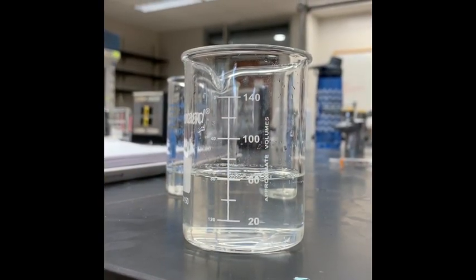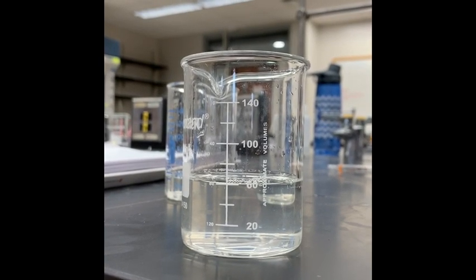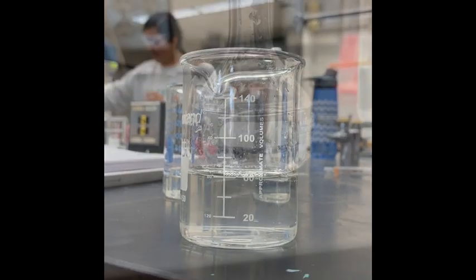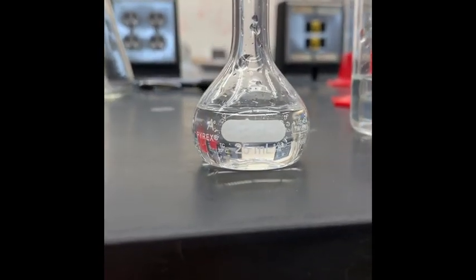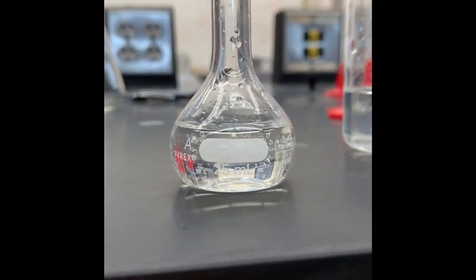This is before and after we added 20 milliliters. It was originally 40 milliliters, and this is the meniscus after. This is a 25 milliliter flask with the 20% stock solution in it.